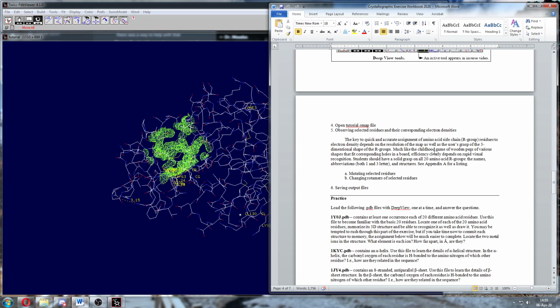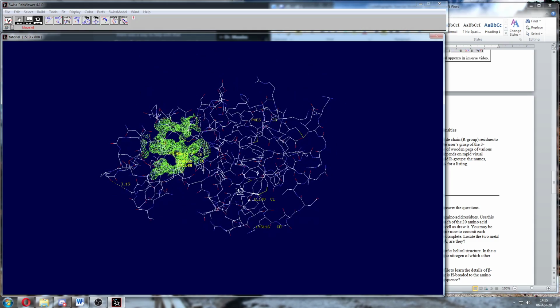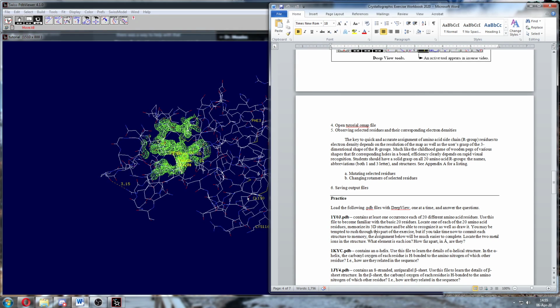Also, you'll notice in here that, well, not this structure, we'll get to it, that you should find some ions or isolated atoms like this one right here. Okay? We already labeled this one as chlorine. So do go through and find whatever amino acid you want to practice. And when you think you're ready, kind of like a little mini test for yourself, I want you to open this other file and do this.